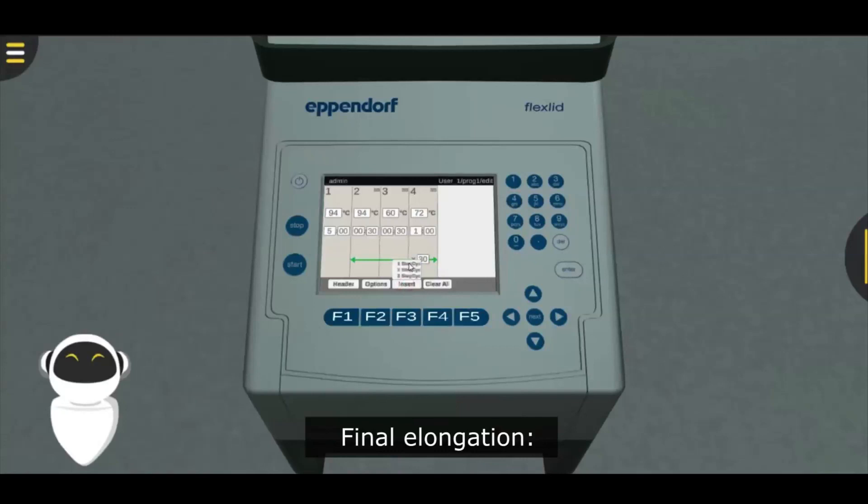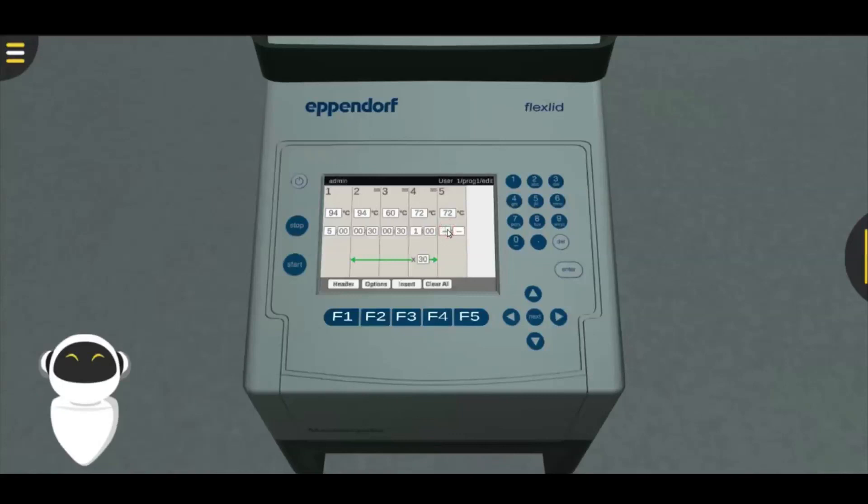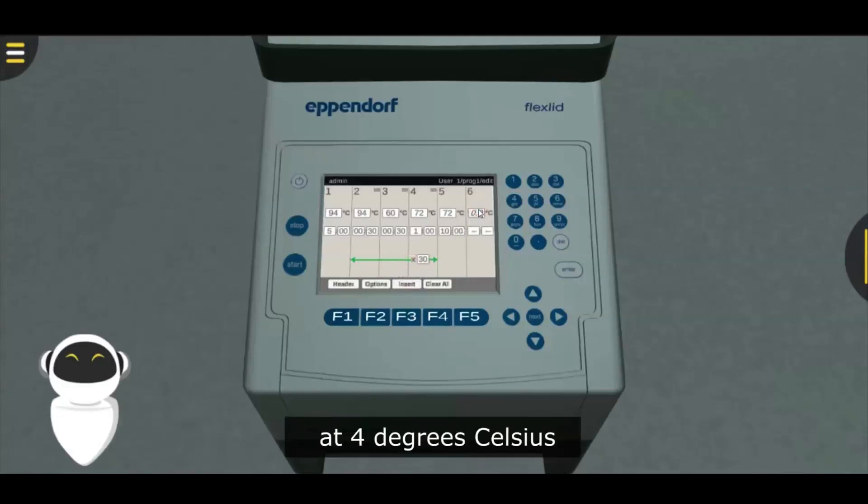Final elongation at 72 degrees Celsius for 10 minutes, for 1 cycle. Final hold at 4 degrees Celsius for an indefinite time, for 1 cycle.